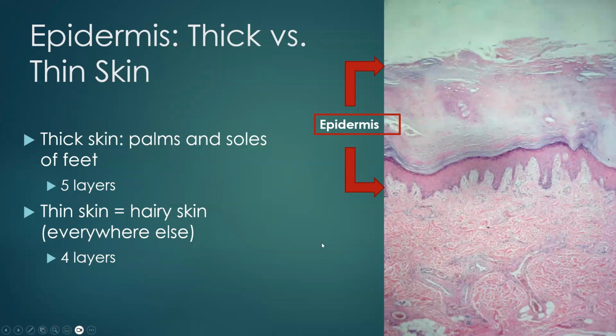I like to use this one a lot on the lab exam because it shows the epidermis, the dermis, and the basement membrane really well. So what we have up top, this is our apical surface. So this is facing the external environment. Sun rays would be shining down here onto our epidermis, which is this entire layer or series of layers.